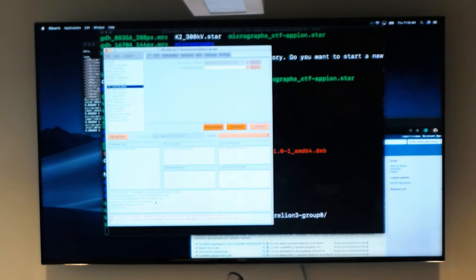Okay, so let's look at your directory structure. So if you look in the micrographs folder, it's empty. So another way of doing it, so we're going to use this. Oh, so I have to relink it every time I start because I had to restart. Or no, is that not? No, you linked it into the wrong place. Really? Okay. So if you go another way, it'd be like, okay, I'm expecting a micrograph here. So if I go list, no such file or directory because it's not there. Where is it? It's one up.